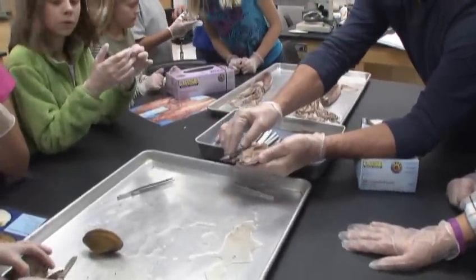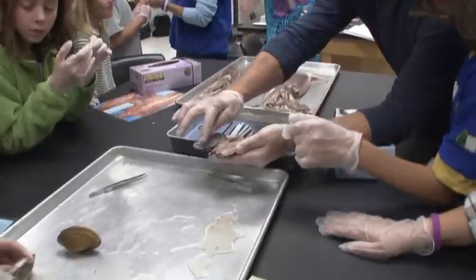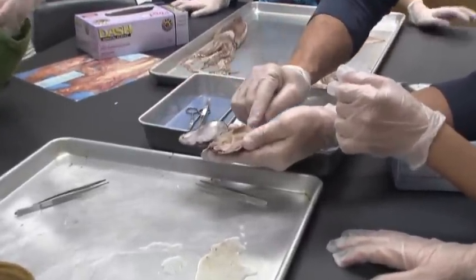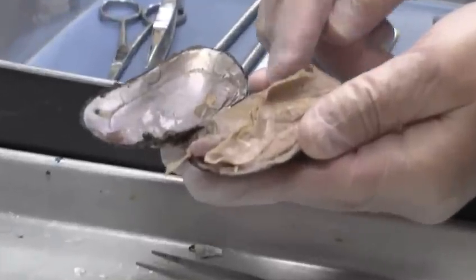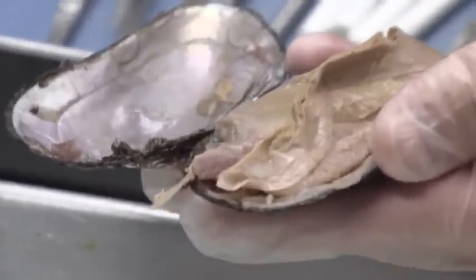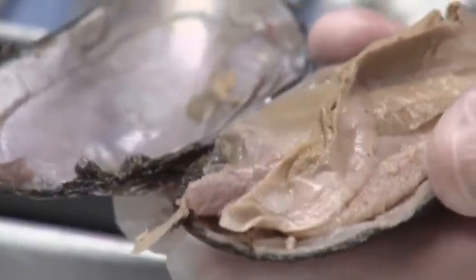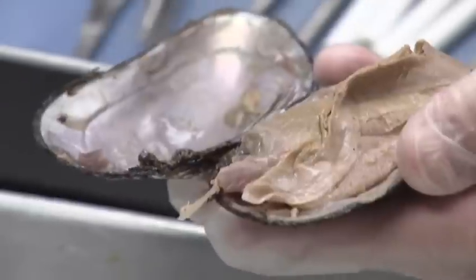Okay, now I'm just going to open this up because here's your hinge, and there's teeth on these hinges here. And look, remember I told you about the muscle scars? Here's where the muscles attach. So when somebody's clamming up, it's these muscles that are pulling it so tight you can't open it. Now, if you're a saltwater clam, you can open it up like if you're an octopus or a starfish. You grip on here and you just pull it so hard and finally it just goes, oh, okay, I give up.